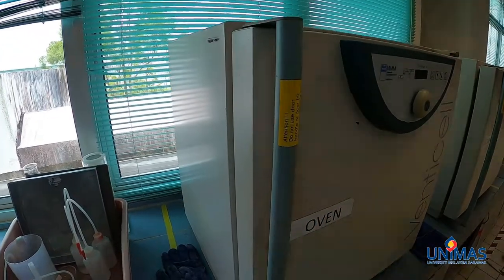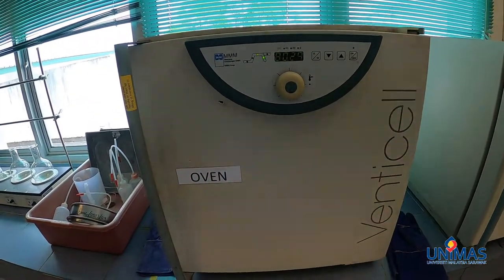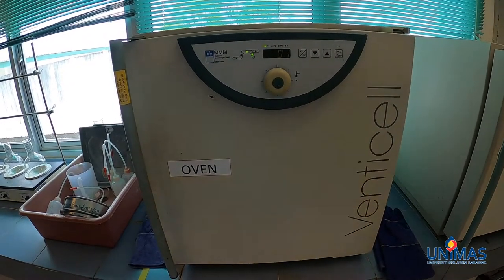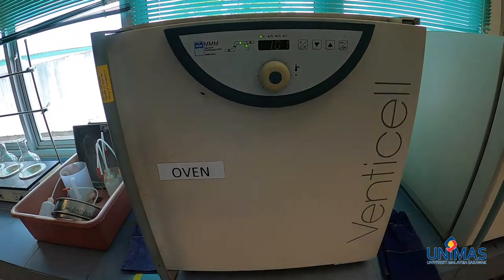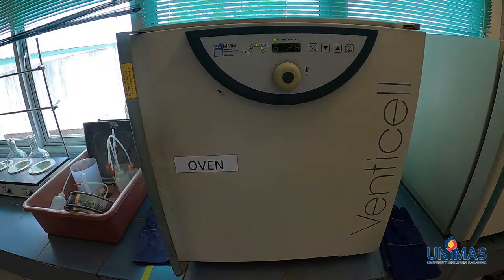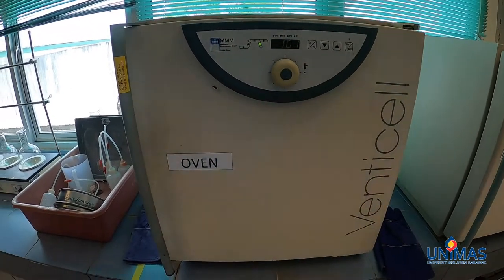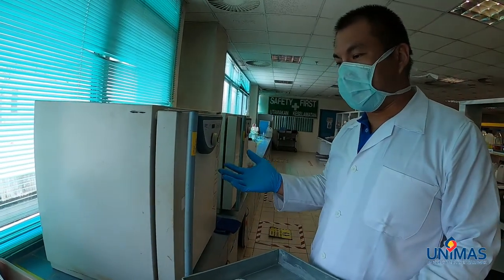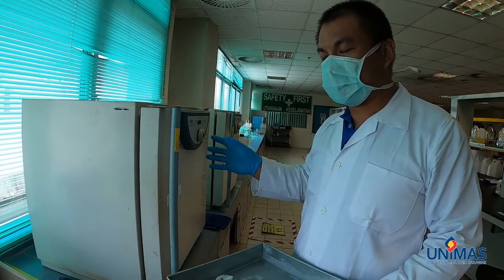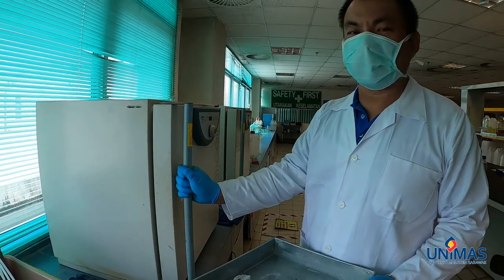We have just placed the glass microfiber disc into the oven, which is set between 103 to 105 degrees Celsius. We will let it dry for an hour to drive off the moisture in the disc, and then let it cool down in the desiccator before we start using it. It's been about an hour since we left the glass microfiber disc to dry in the oven, so now we are taking it out to be put into the desiccator.